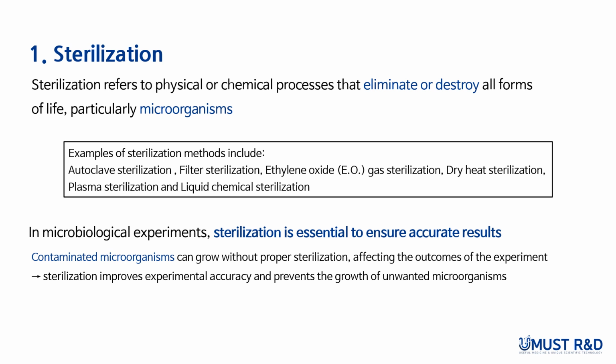Why is sterilization necessary in microbiological experiments? Without sterilization, unwanted, contaminating microorganisms can grow and affect the results of the microorganism we want to experiment with. Therefore, sterilization is essential to prevent unwanted microbial interference and ensure the accuracy of the experiment.